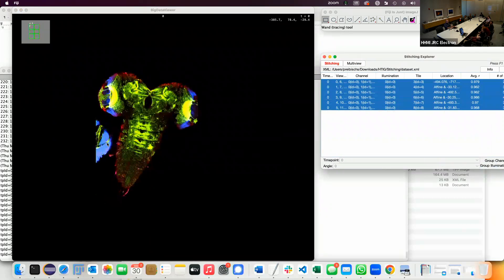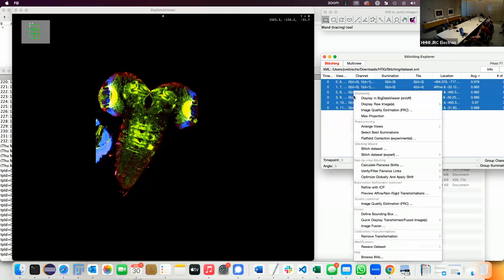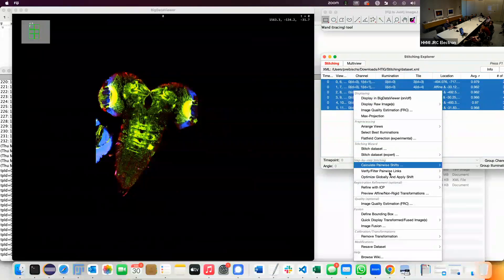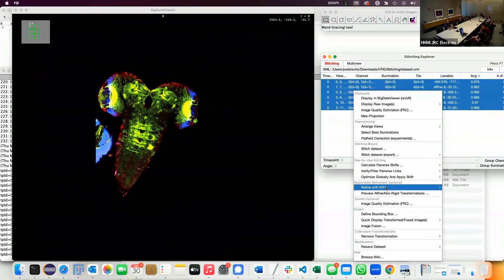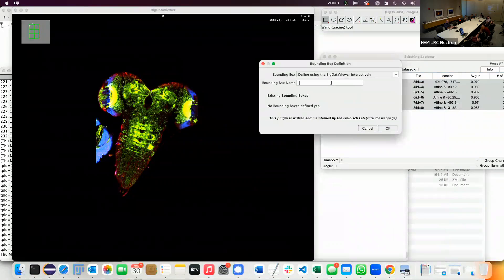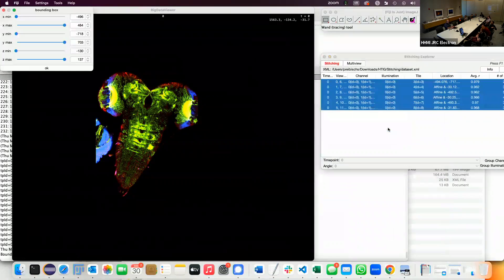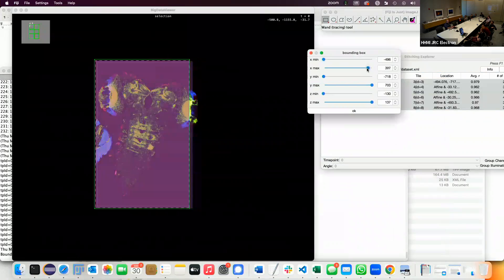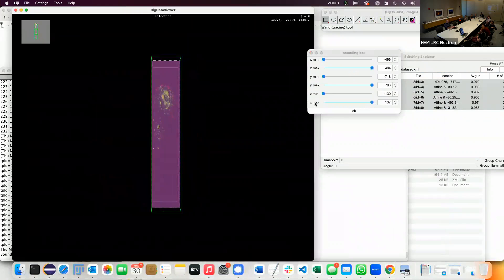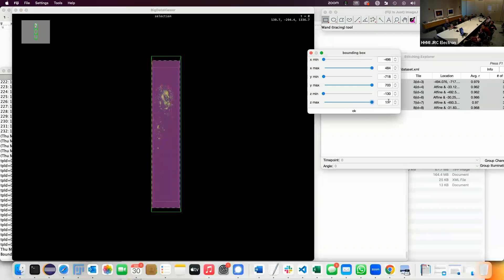So this is a very basic alignment. Usually the last step is to export that volume into a fused stack. For that, if you don't want to export everything, you can define the bounding box. You can interactively say you only want parts of the image, or in Z this is too big and you want half. It usually makes sense with a large dataset to just export a small region at full resolution first to see if it's actually good. You can either downsample everything for fusion or select a small box to check.